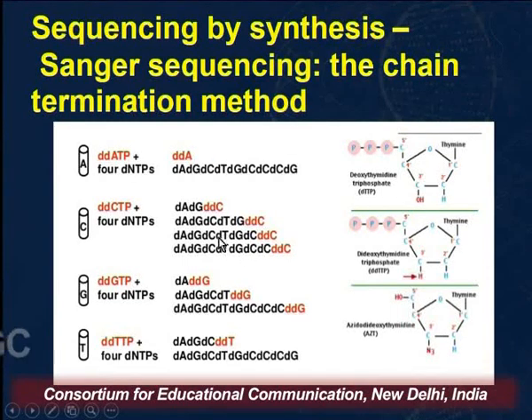In a particular reaction, because you have normal dNTPs and you have also added this altered ddNTP, you will have a series of fragments where the chain is terminated. If you run this PCR amplification up to a particular number of cycles, you will have a one nucleotide resolution, with fragments terminated one base pair apart.